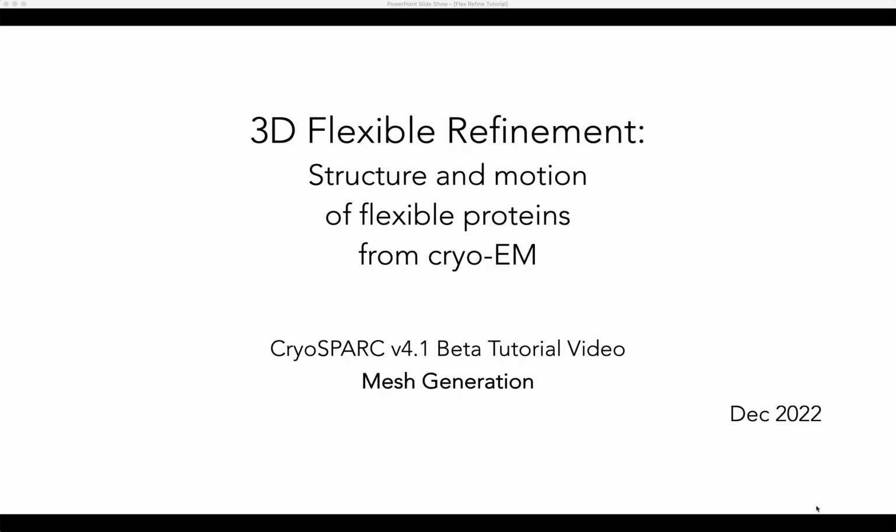Welcome to a short advanced tutorial about 3D flexible refinement in CryoSPARC version 4.1 beta. This tutorial covers mesh generation. Please do read the corresponding section in the tutorial on the CryoSPARC guide as well.